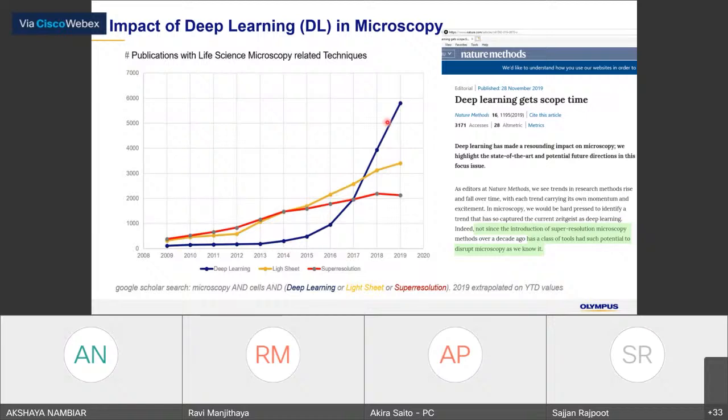I compared with light sheet or super resolution, which are new technologies for observation, but you can clearly see that deep learning analysis is growing more than those new observation technologies. All of the biologists are having some issues doing segmentation, and deep learning is doing a good job for it.